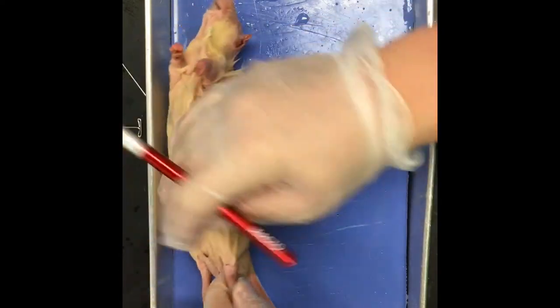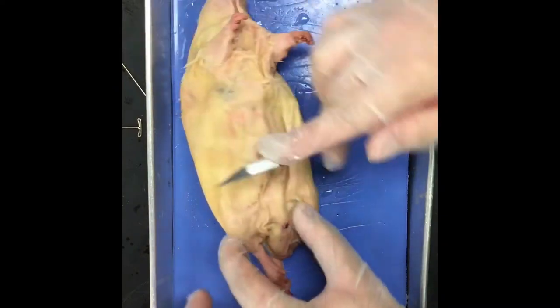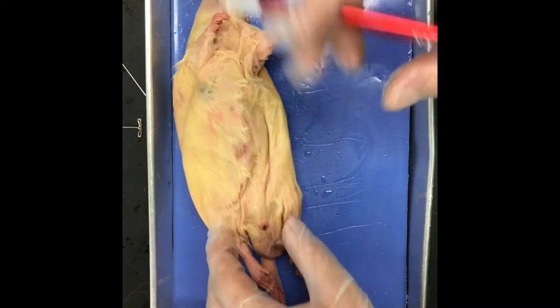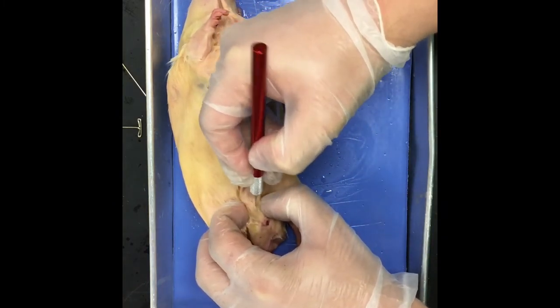All right, so now that that has been cuffed on all four legs, you'll always start and go from bottom to top, always this way, all right? So as a start, you're just gonna make a small incision, poke through just a little bit.